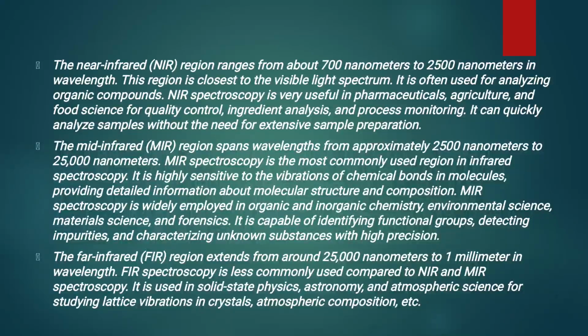The far infrared region extends from around 25,000 nanometers to 1 millimeter in wavelength. FIR spectroscopy is less commonly used compared to NIR and MIR spectroscopy. It is used in solid-state physics, astronomy, and atmospheric science for studying lattice vibrations in crystals, atmospheric compositions, etc.